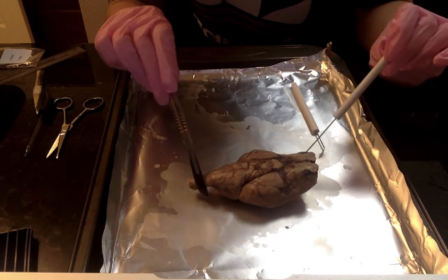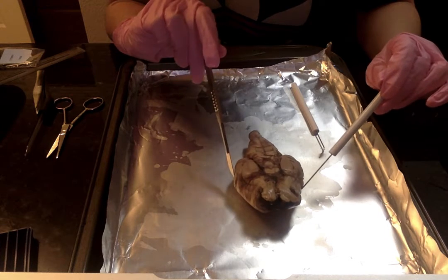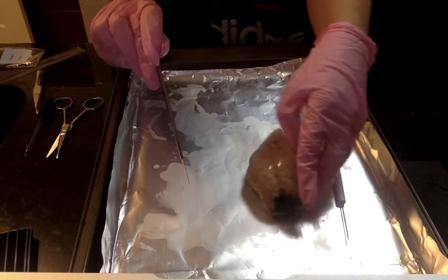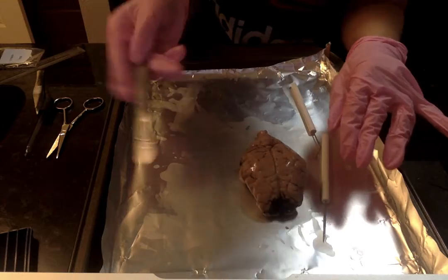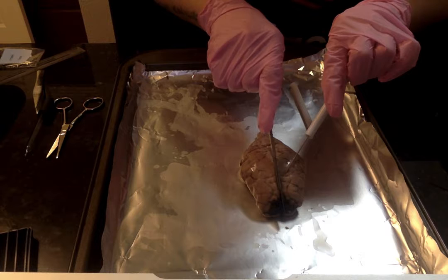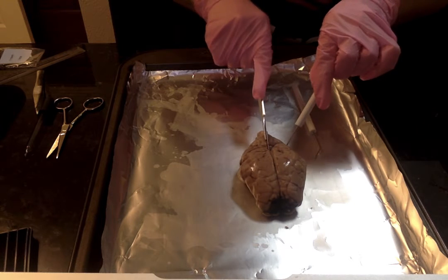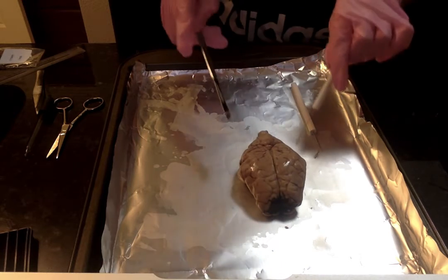and I'm going to slice through the brain kind of along the center, starting at the cerebrum, and work my way down to the spinal cord through the medulla and the pons. I'm going to be dissecting it sagittally. Ooh, that is very soft tissue.